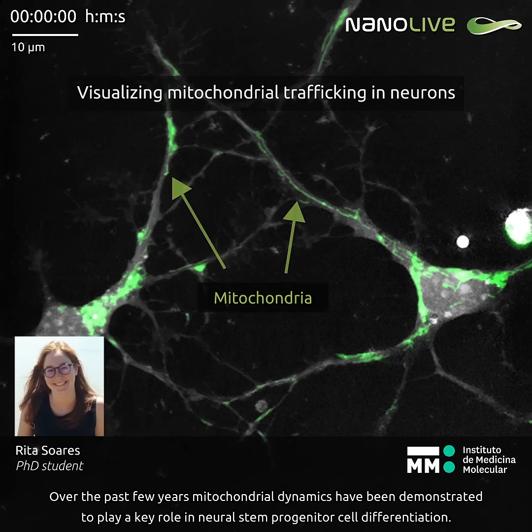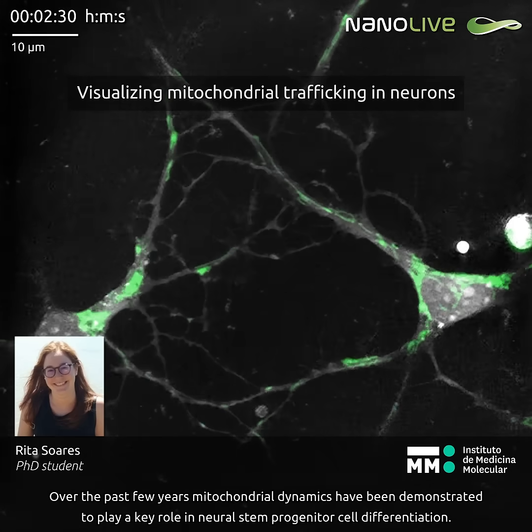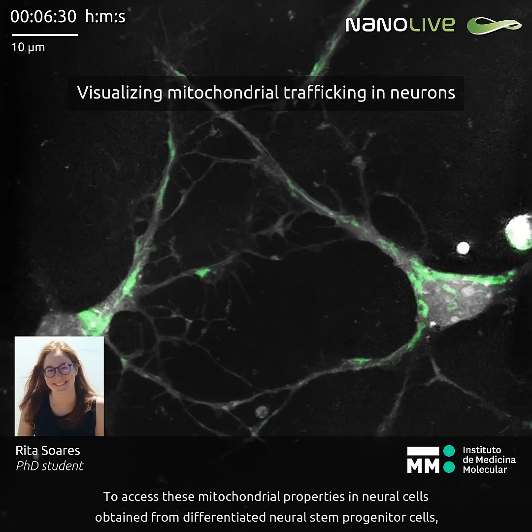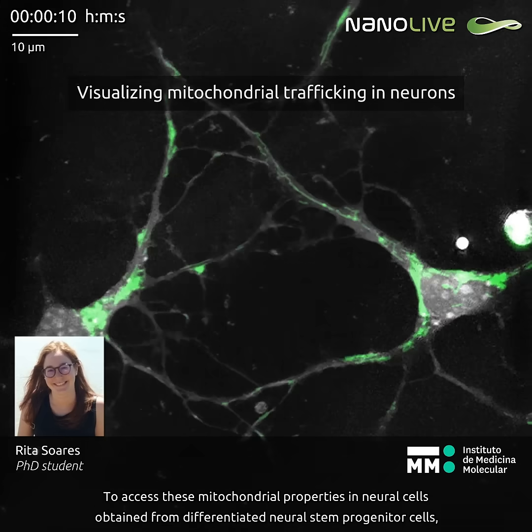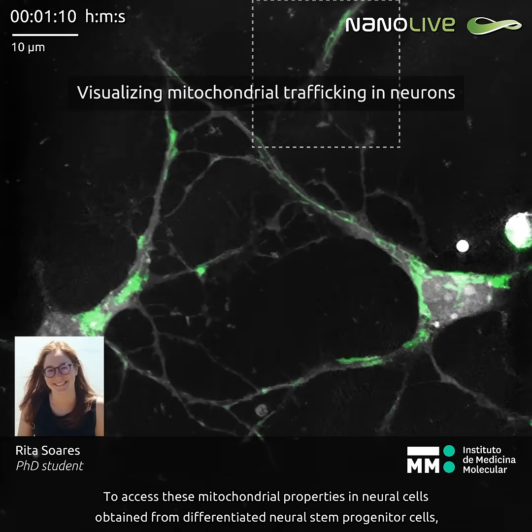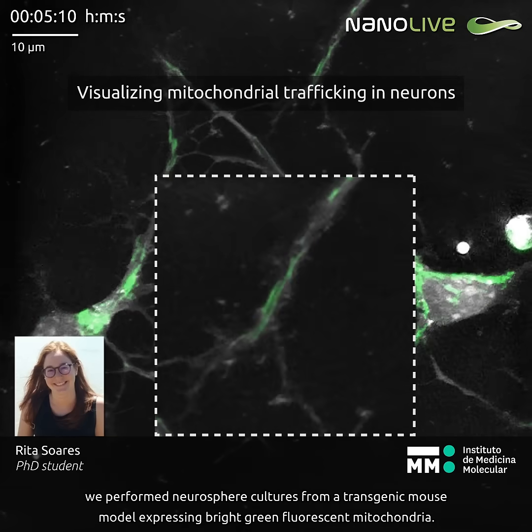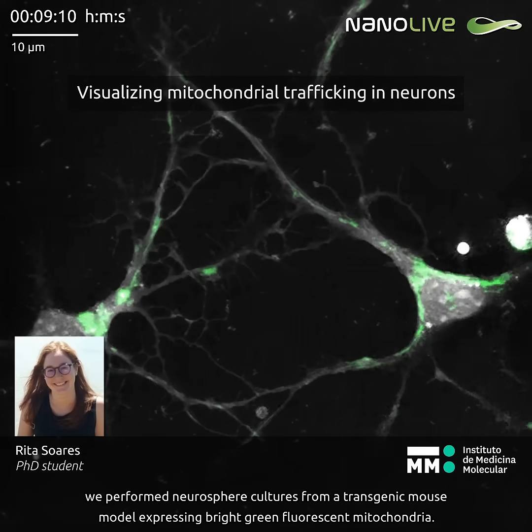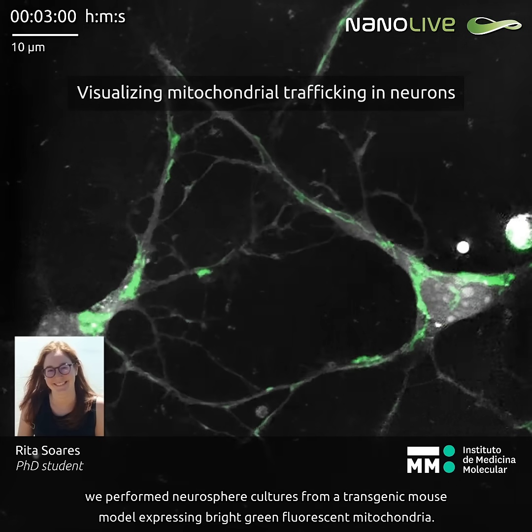Over the past few years, mitochondrial dynamics have been demonstrated to play a key role in neural stem progenitor cell differentiation. To assess these mitochondrial properties in neural cells obtained from differentiated neural stem progenitor cells, we performed neurosphere cultures from a transgenic mouse model expressing bright green fluorescent mitochondria.